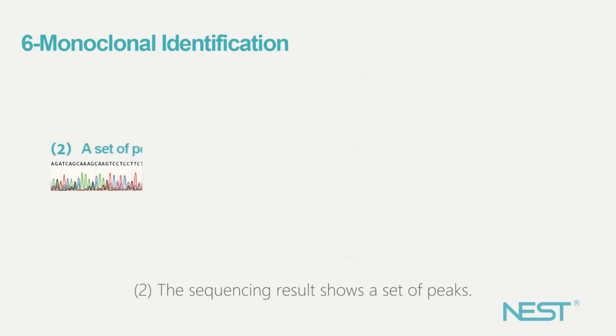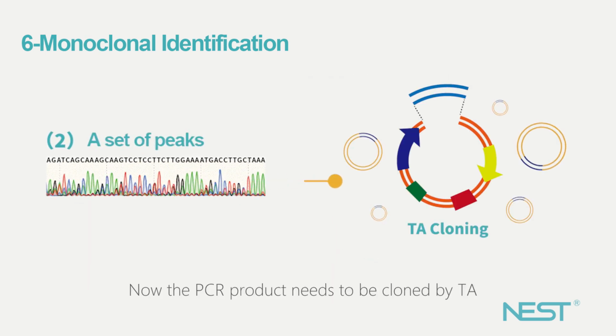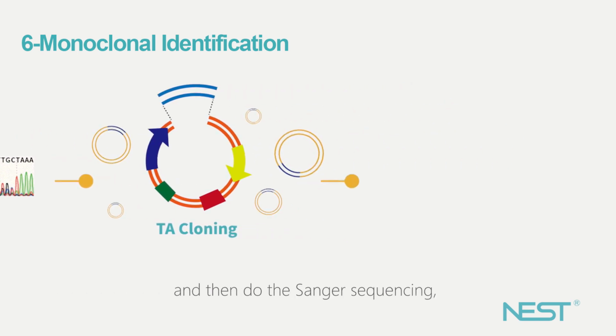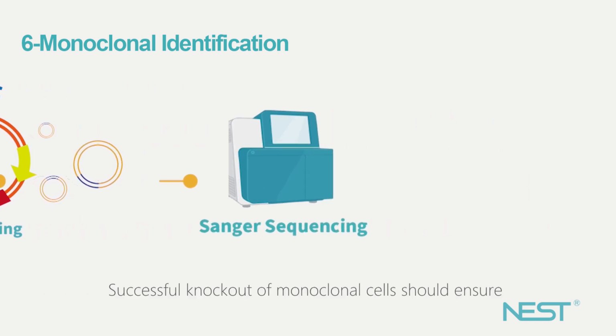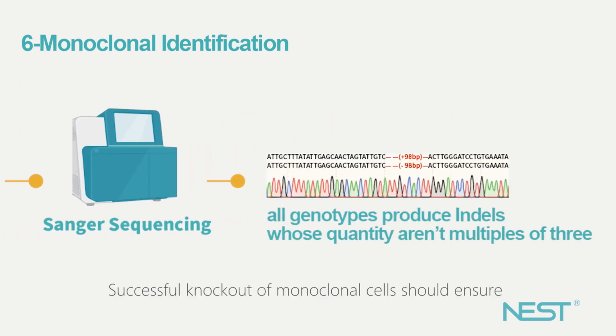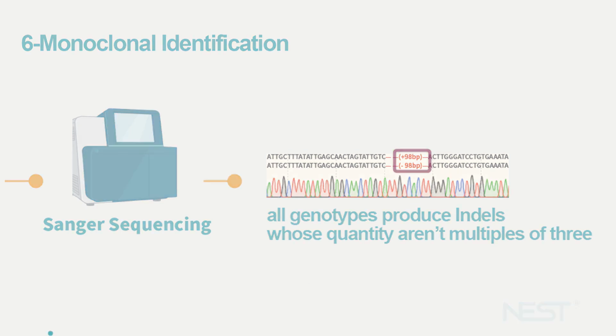2. The sequencing result shows a set of peaks. Now the PCR product needs to be cloned by TA and then do the Sanger sequencing, or directly the third-generation sequencing. Successful knockout of monoclonal cells should ensure that all genotypes produce indels whose quantity aren't multiples of 3.